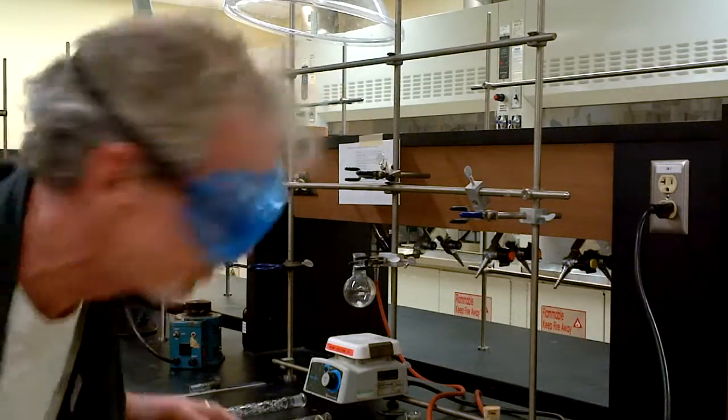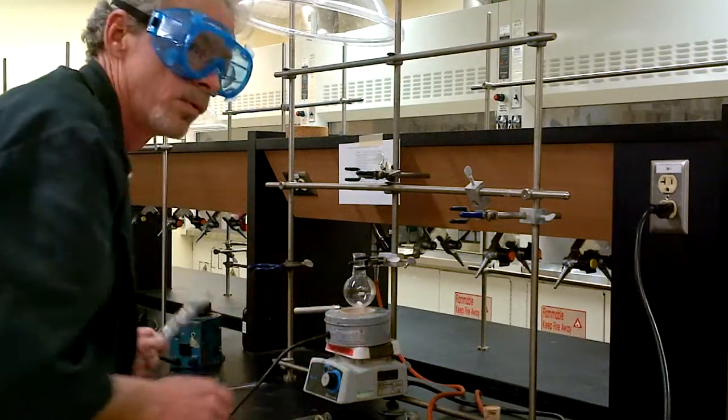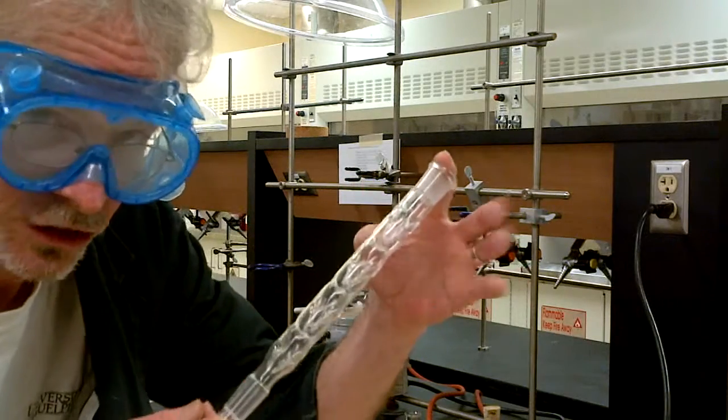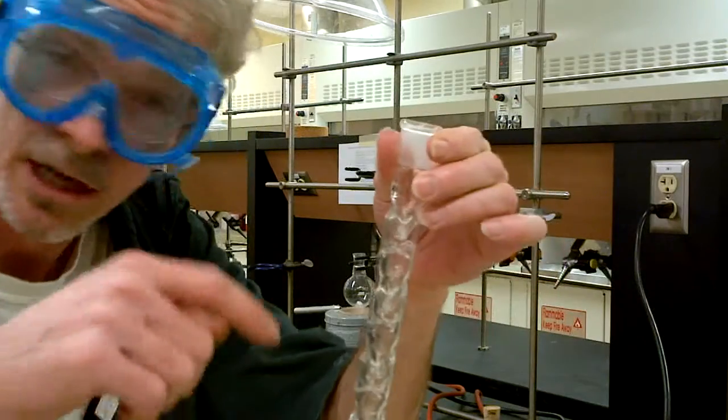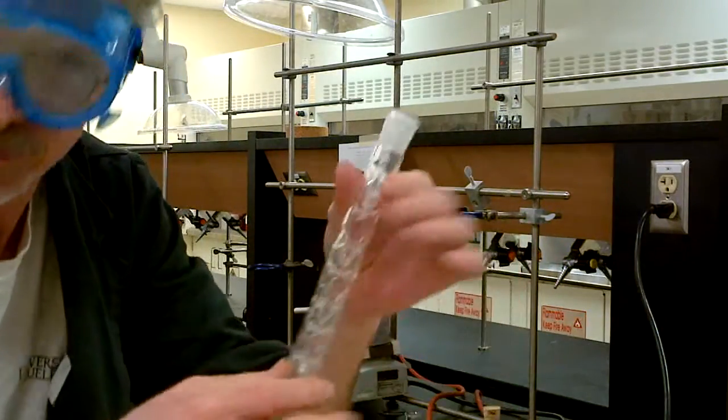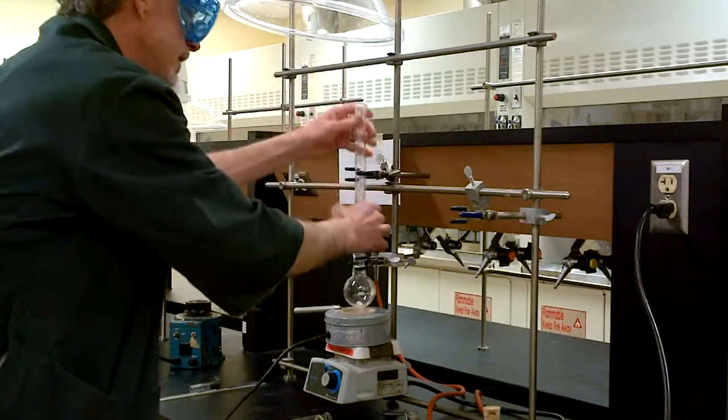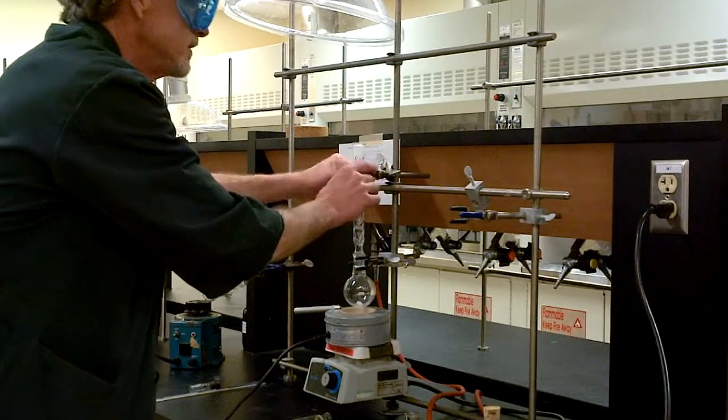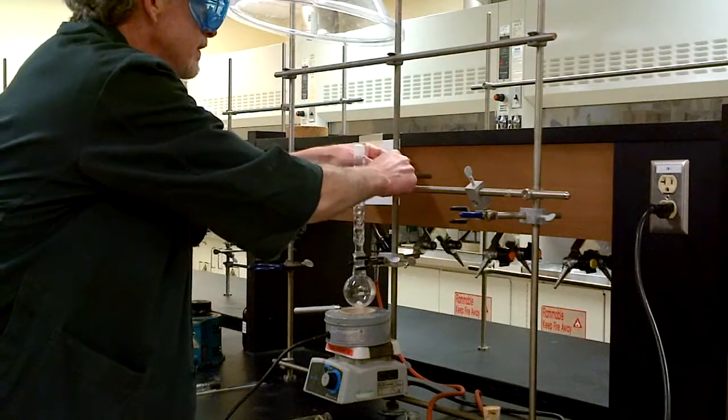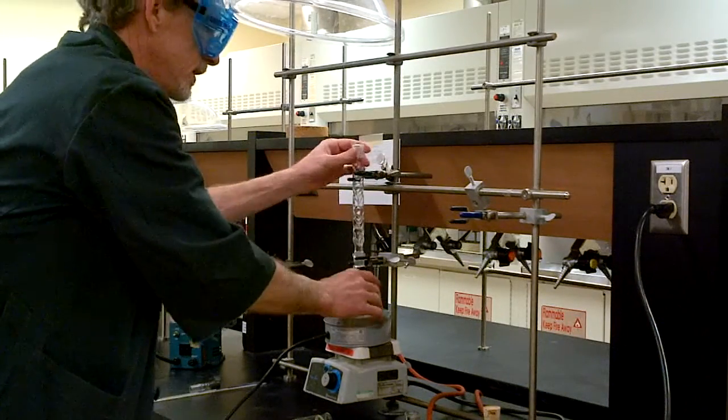So there we go. We have the fractionating column. This one is called the vigru column. It's got funny points in it and it's a French name. And off it goes right in there. And you'll notice I have a second clamp right here. This is going to make sure that the apparatus does not fall over. Falling over is bad.